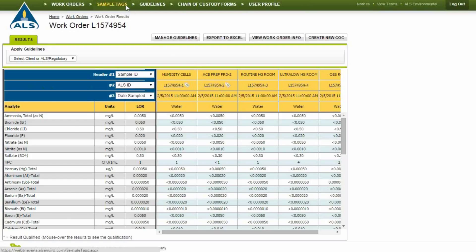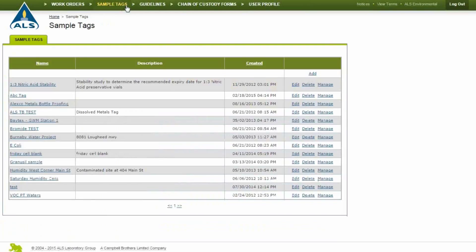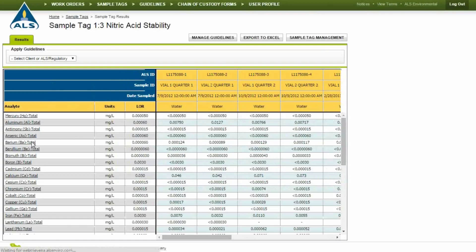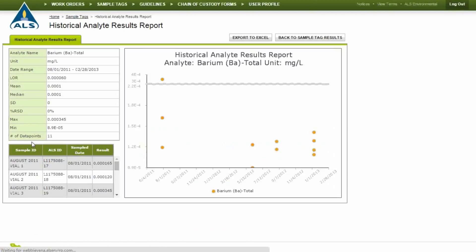To view the sample tagged results, click Sample Tags on the top links and click on the Sample Tags results you wish to view. Click on an analyte to view the trend of an individual analyte results over time. Data trending statistics and a graphical representation of the results over time are displayed.